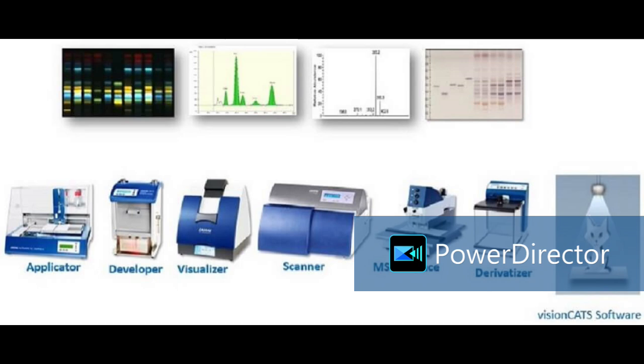Then this is an example of different sugar detection in liquors like vodka and rum samples. We can detect sucrose, and I think fructose and glucose sugars are detected. How much sugar should be in liquors is also decided by FSSAI. If it exceeds the limit, it is not accepted. So we can detect the sugar level.